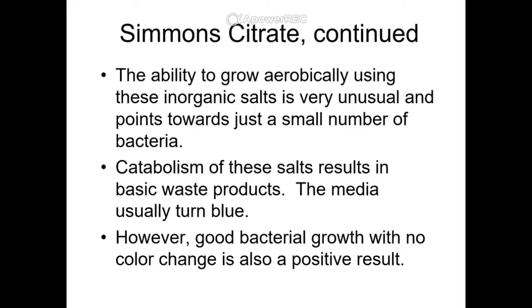Catabolism of these salts results in basic waste products, so that is waste products that are high in pH. And these waste products turn a pH indicator from green to blue. However, even just having good bacterial growth in this culture, even though we might not get a strong color change, just having bacterium that can survive on these inorganic mediums is considered a positive result as well.